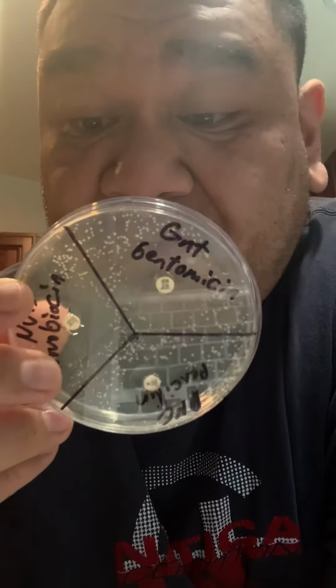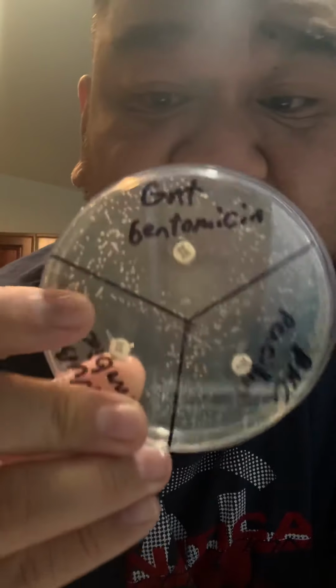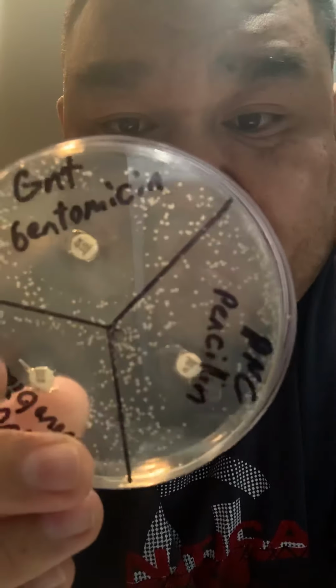There was a lot of growth after 2 hours of letting it incubate. When I poured in the specimen, I let it settle for 2 hours and spread it. After the 2 hours, I inserted the antibiotics per section in the middle of the section, and I let it incubate for 24 hours. So there were results, because you can see there are white stains everywhere. So I believe the antibiotics results are positive, because they show the antibiotics stop the growth of some of the microbes.